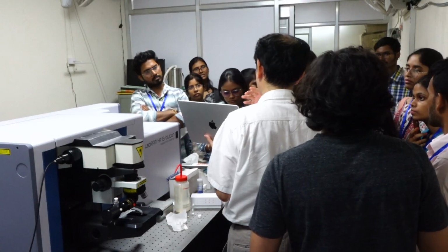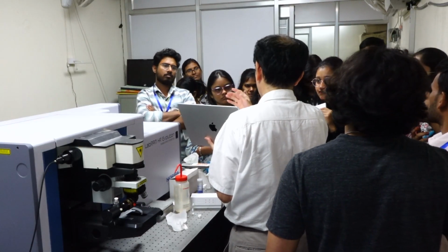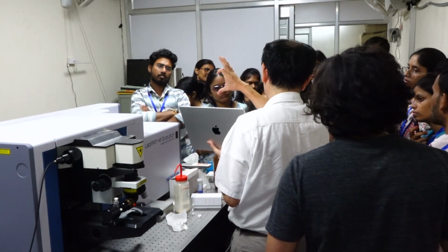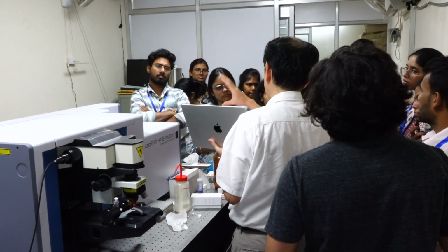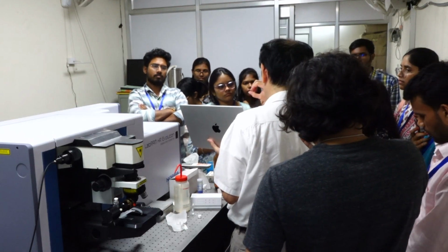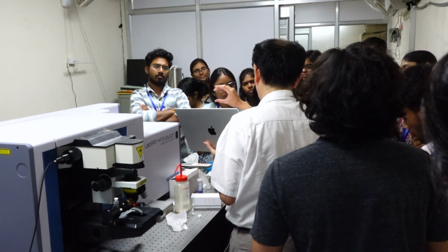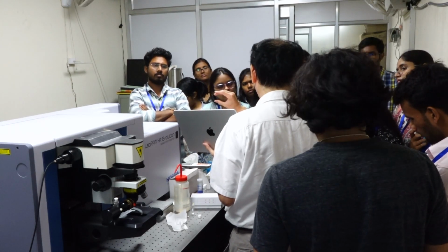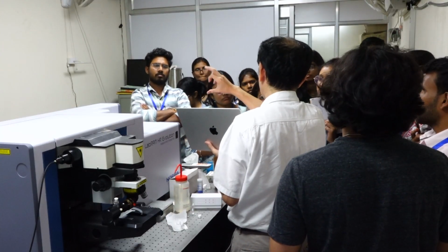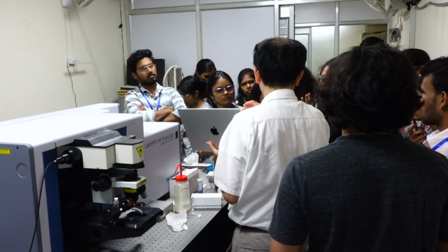My explanation is about the exposure time and accumulation number. If you set the exposure time short and increase the accumulation number, then the AD conversion noise increases. Instead, you should set a longer exposure time and correspondingly a smaller accumulation number. That's better. But if you have time, increasing both is the best.